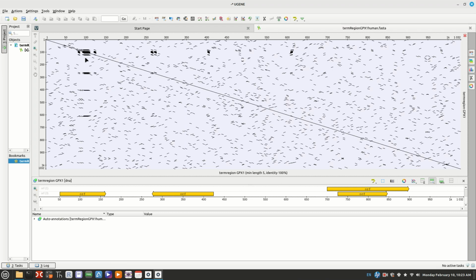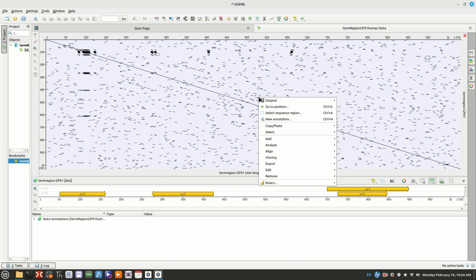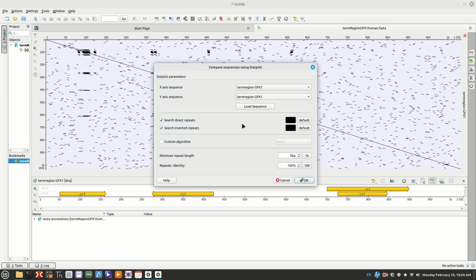So now, remember this is about 6,000, and this is a little bit before 6,000. This is a little bit after 7, I think. So just remember when you're translating back to the other one where this was. But now we've got the whole thing, and we know all this is the region we want to look at. So you don't have as much going on. You don't have to move around and worry about where you're at.